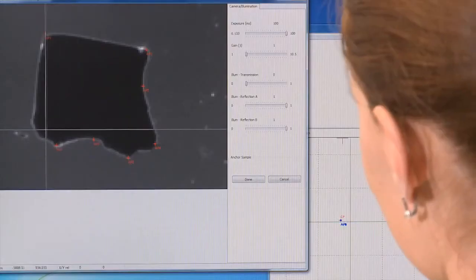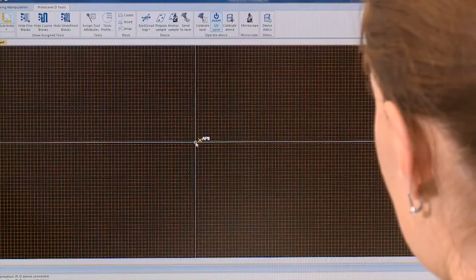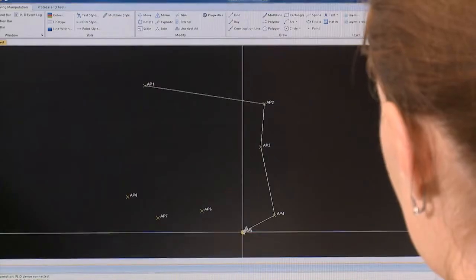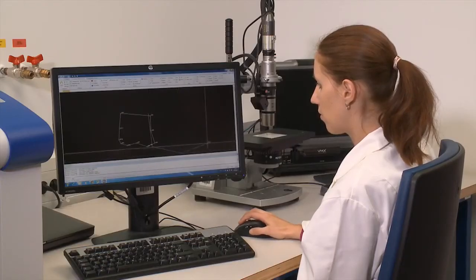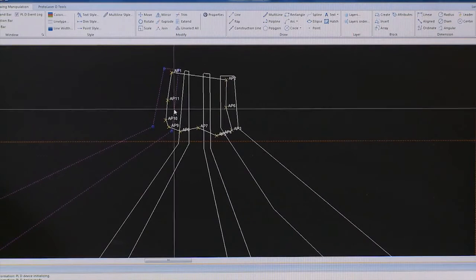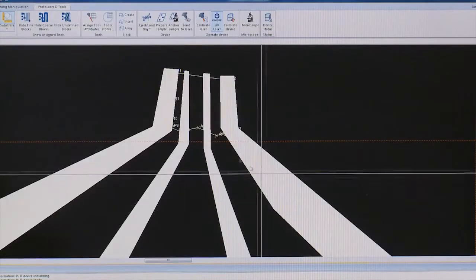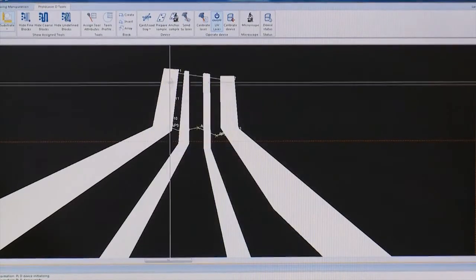The position and shape of a targeted crystal is marked. The pattern doesn't have to be designed in advance, but can be drawn on the spot. Electrodes are easily outlined using drawing tools or simply imported from another CAD software. With drawing and working parameters such as laser beam diameter and exposure dose, the pattern is defined and transmitted to the device.